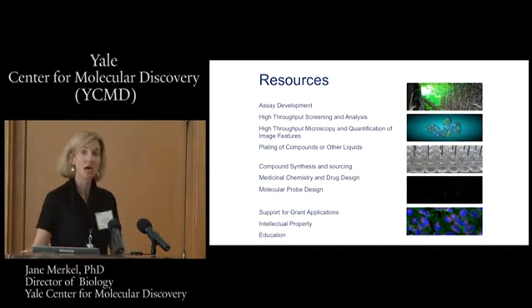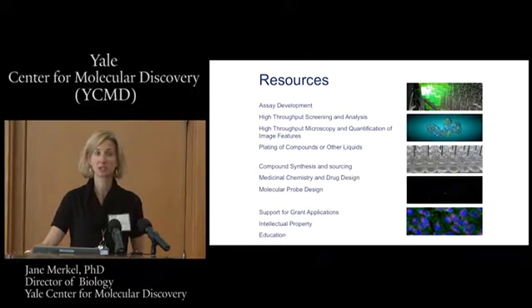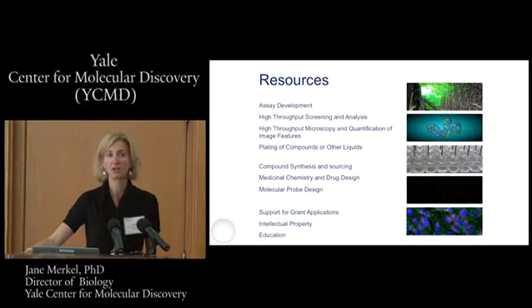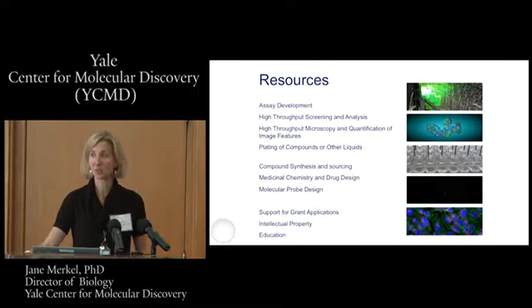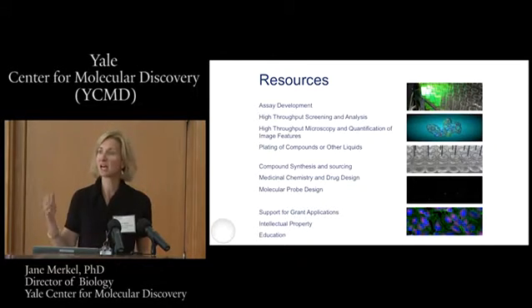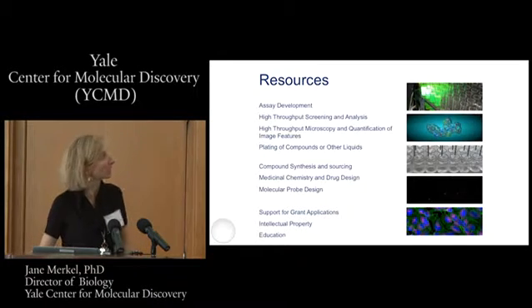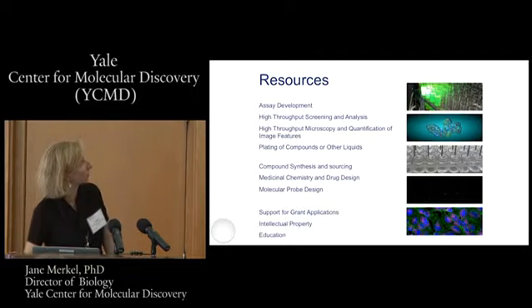We do image-based assays, so we have a fairly high throughput fluorescence imager. It's a four color fluorescence, wide field instrument, and typically we're doing this with fixed cells, and then we can extract and quantify features from those images. We're converting the complex images to numbers, like percentage of cells with signal over intensity or co-localized signal or any number of things. So we're developing those image analysis algorithms with you for your data.